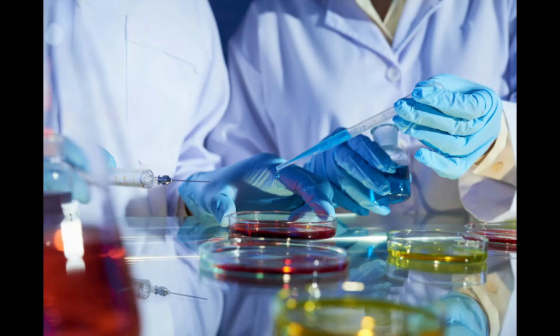Right now, hopefully, all that's in that broth there is Serratia marcescens, nothing else in there. And so when y'all do your transfer and you grow your microbe on all of these different types of media here, hopefully only Serratia grows on it. Nothing else, just Serratia. That will mean that you were able to transfer aseptically, right? That you did it correctly.